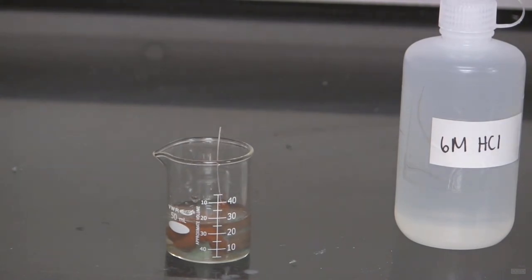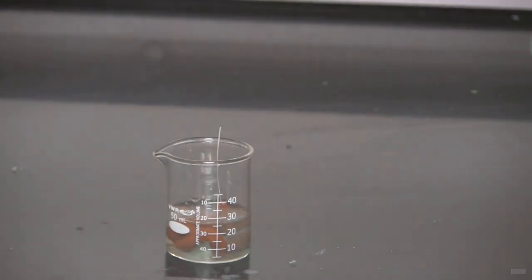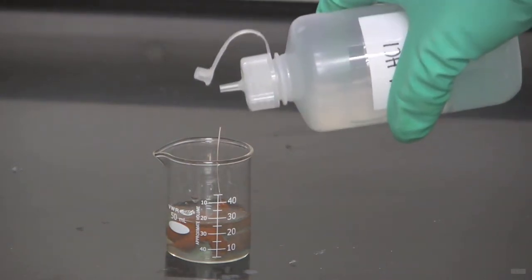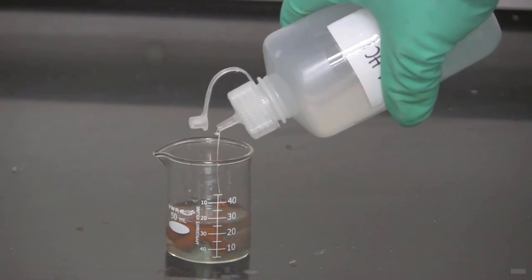So it's been 30 minutes. The solution has gone pretty much colorless now. I'm going to add five drops of six molar HCl. And that will have the effect of dissolving any aluminum salts that might have formed.